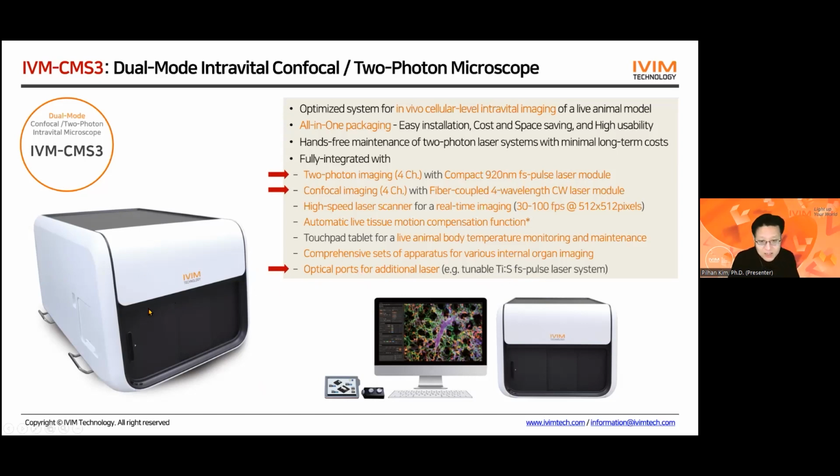And then it can also connect with the fiber-coupled 4-wavelength CW laser module for 4-channel confocal imaging. So this microscope is capable of both confocal and two-photon imaging with 4 channels.